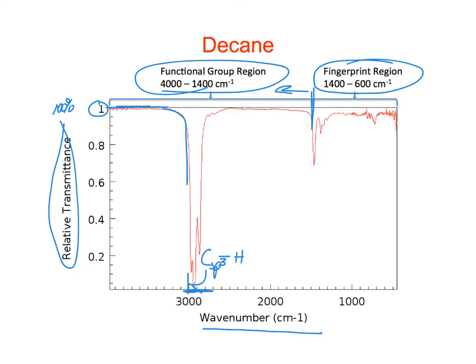And you don't want it to hit 0, correct? Well, if there's no bond that absorbs in that area, then it should be... Oh, you mean at 0 all the way down to the bottom? You don't want it to hit 0 because you're not sure if that actually completed its little peak. Yeah, I think it's too concentrated. You can run just neat samples in IR, but if there's 0 light coming through, I guess we can mess it up using KBr pellets sometimes.